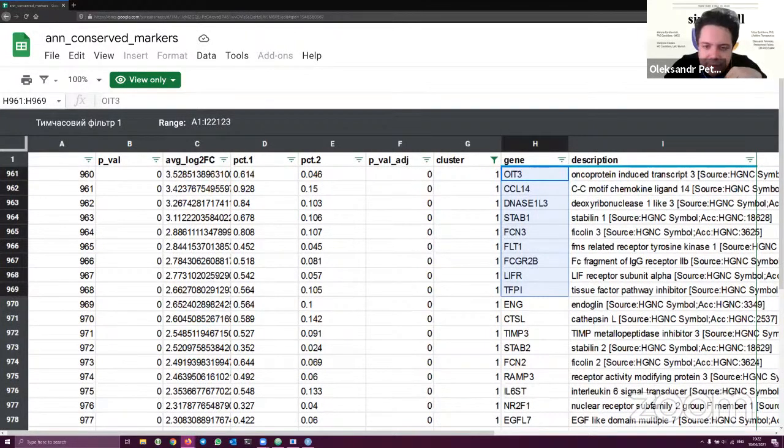So Veronica 14, Akembo 15, Meha 16, Paula 17, and I think we have one more cluster which goes to Roxane.